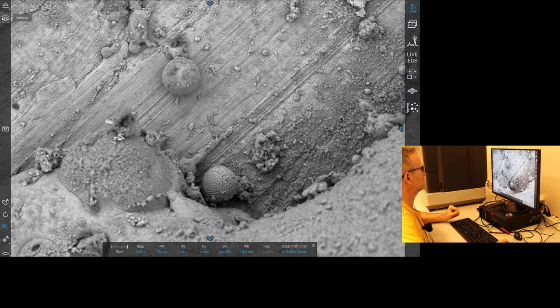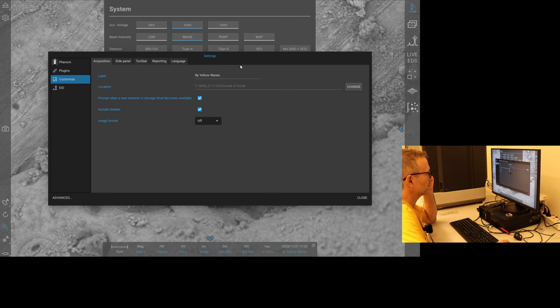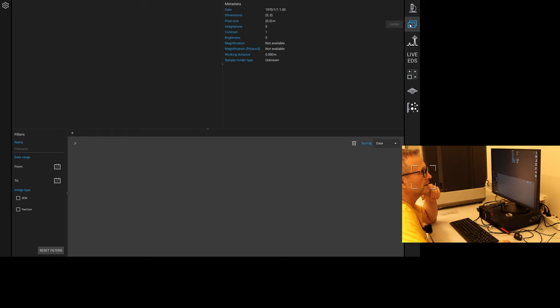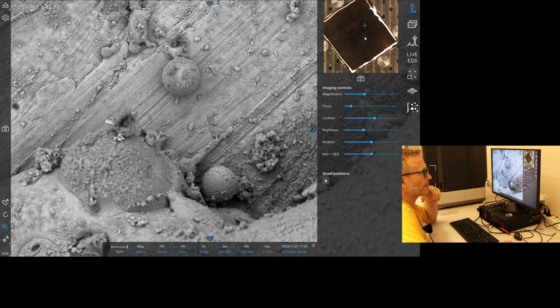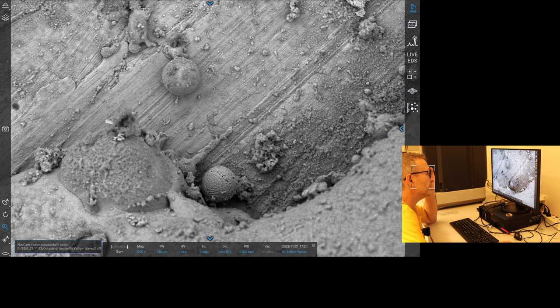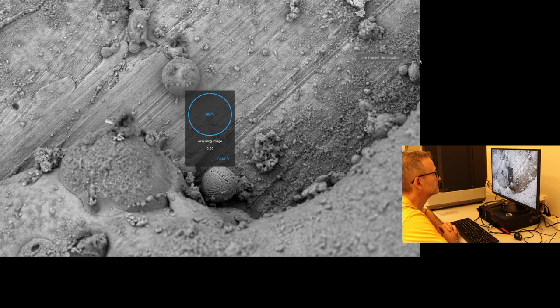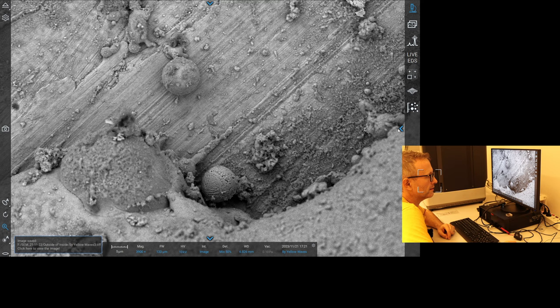So we need to do some setup here, different directory. Okay, close. And we will first take an image of the location, which is there, and which is more specifically there, and I will take an image of this, and it's on 384, that's fine, I think. Okay, and I will do a memory shot of this. And we will come out and look at other places.